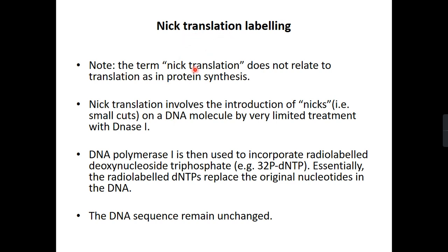Nick translation does not have any relationship to translation itself. Translation, as you know, is the synthesis of protein. But here, Nick means to make a small cut on a DNA molecule by very limited treatment with DNase 1.